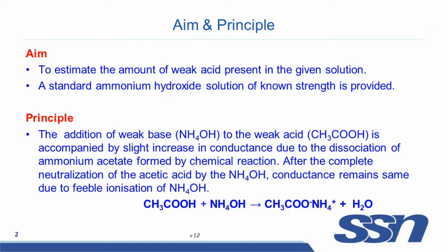After the complete neutralization of the acetic acid by the ammonium hydroxide, conductance remains same due to feeble ionization of ammonium hydroxide. Now, let us see the demo of this experiment.